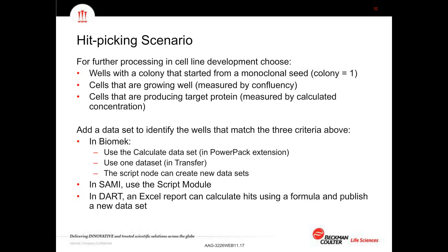What tools would we use to do that? Well, in the Biomek software we can use a calculate data set. We can use one data set in the transfer step or a script node. And then in SAMI we can use a script module.